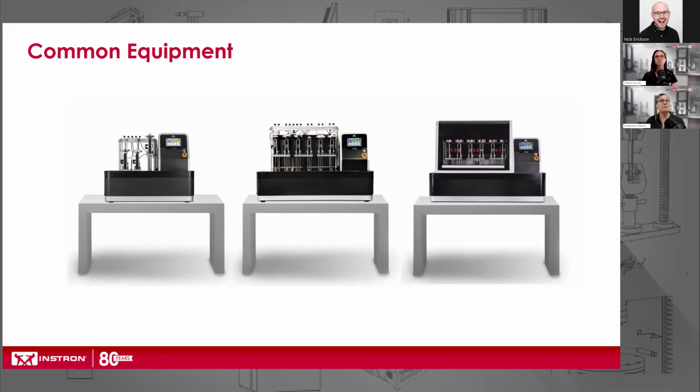If you run three, which would be the system on the far left, three tests gives you the two tests to do your average with, but also gives you one test that, in case you get a big difference between the two, you can have the third as the tiebreaker, if you will. So you can decide between the three the two that are closest, and you're going to average.